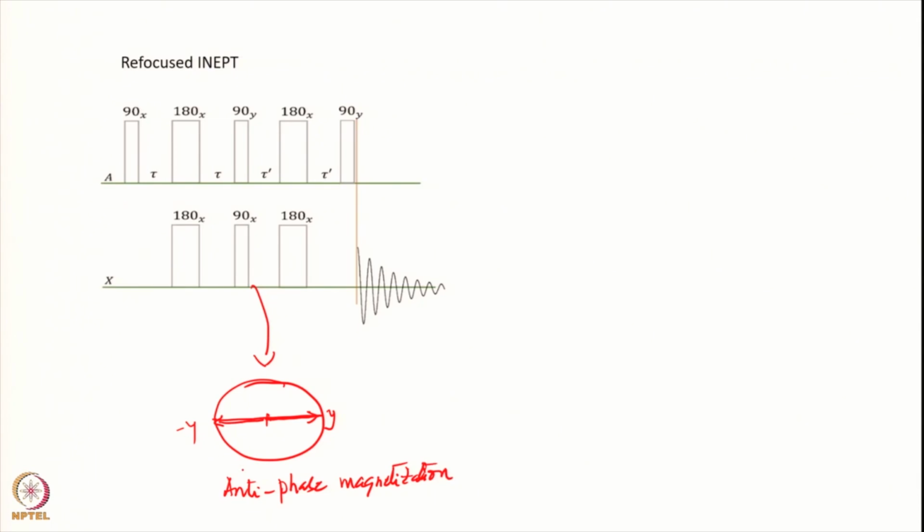Now what we have done is continue the spin echo in an identical manner. You trace the tau and tau, suppose tau dash is equal to tau, you are simply repeating that same sequence. Therefore, during the next 2 tau period, this will again acquire another 180 degree phase difference, and they will become oriented like this. They will refocus. The 180 degree phase difference which was there would be gone, because it rotates by another 180 degrees, meaning they come back in phase. This is called the refocusing.